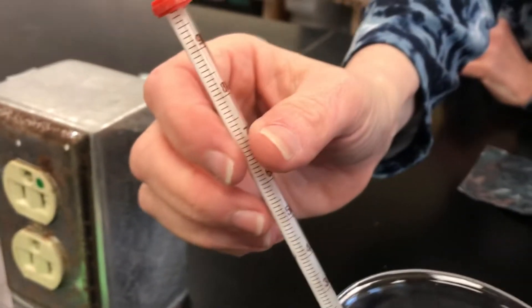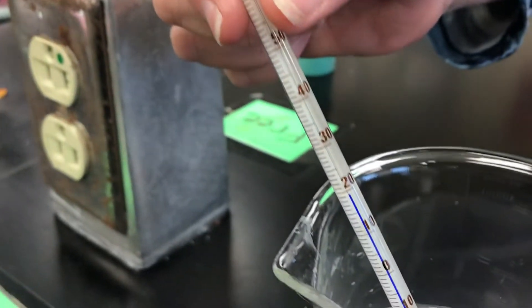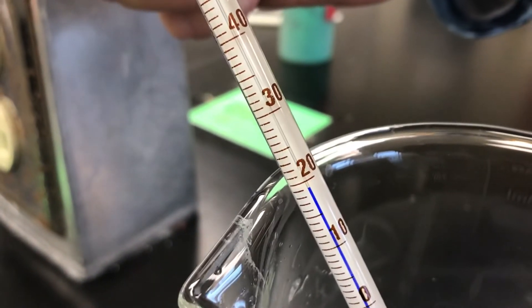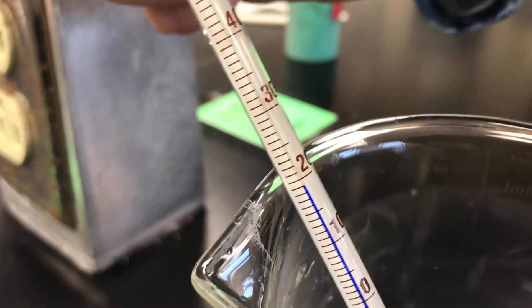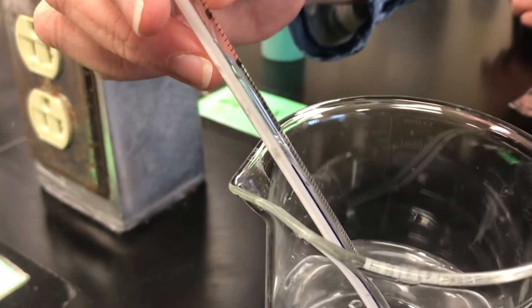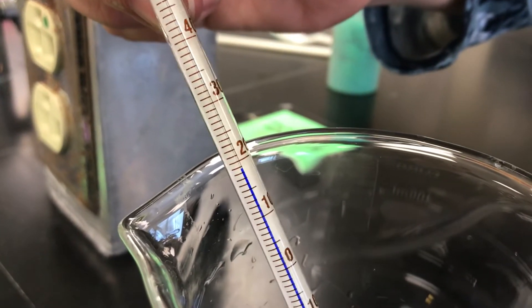We're also going to take the temperature, so we need to know our starting temperature. We'll take a reading as soon as we make sure it's stabilized. I'm going to say that is 18.5. Do we agree? Looks good.